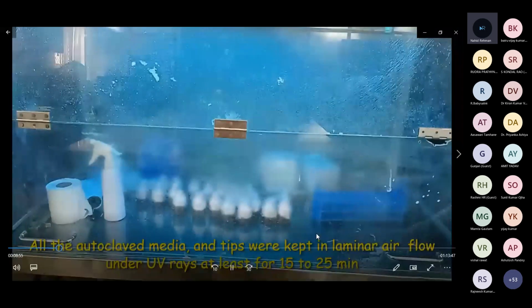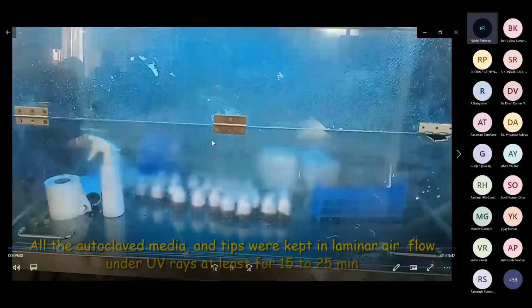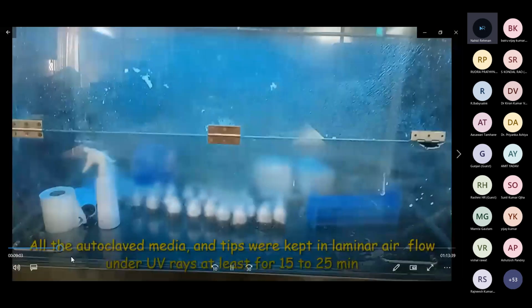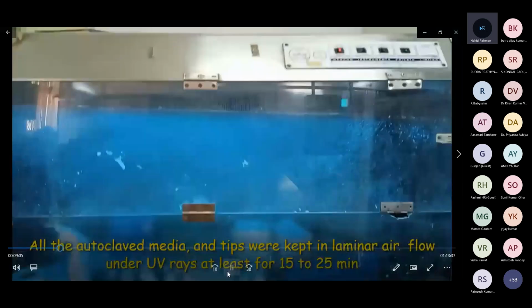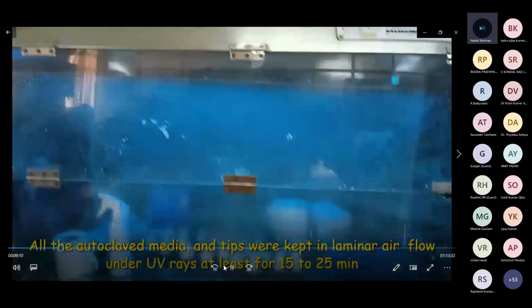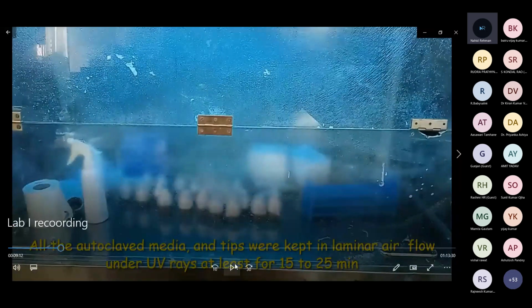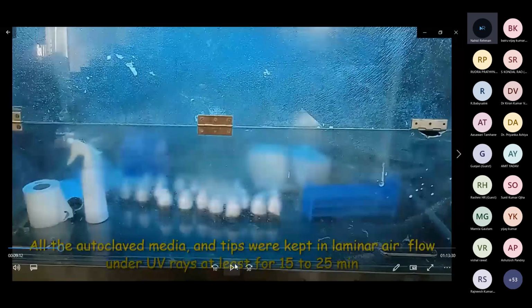And then you have to do all the further proceedings in your laminar airflow. This laminar airflow provides you the controlled air to pass through it. And what happens actually, just a minute, hold on.